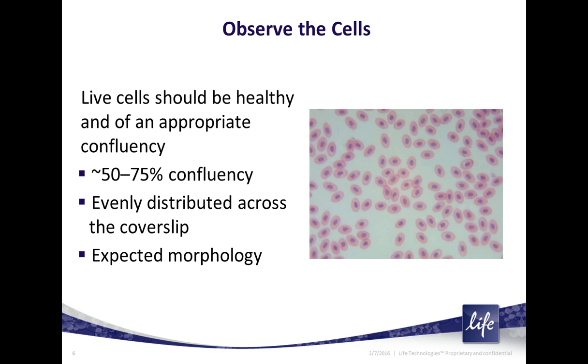The first thing that you want to do is look into the cells themselves, right? Before you do any fixation, you should first take a look at your cells in the cell culture area.